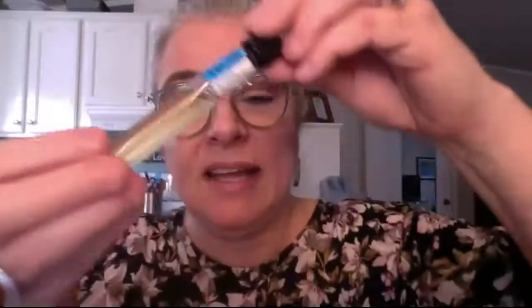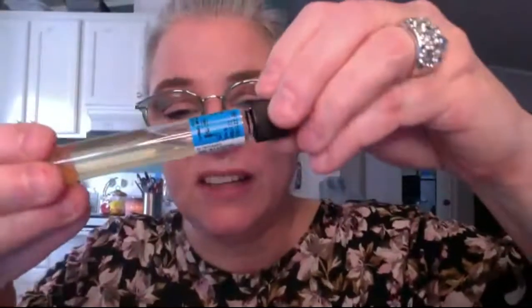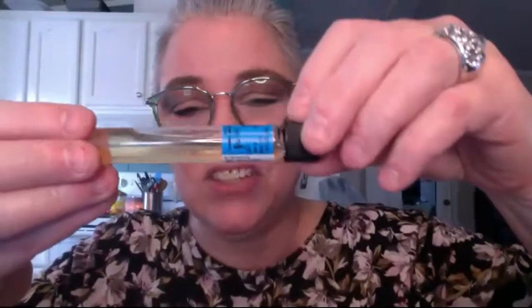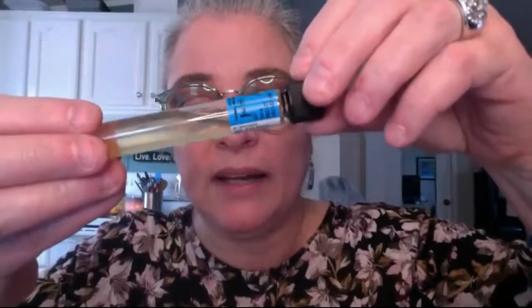This is just uninoculated broth. But if I tilt it, I think you can see it's just a little bit thick. See that? It's just a little bit thicker than a broth would be. And that agar is in there because it prevents the oxygen from dissolving all the way through the tube.